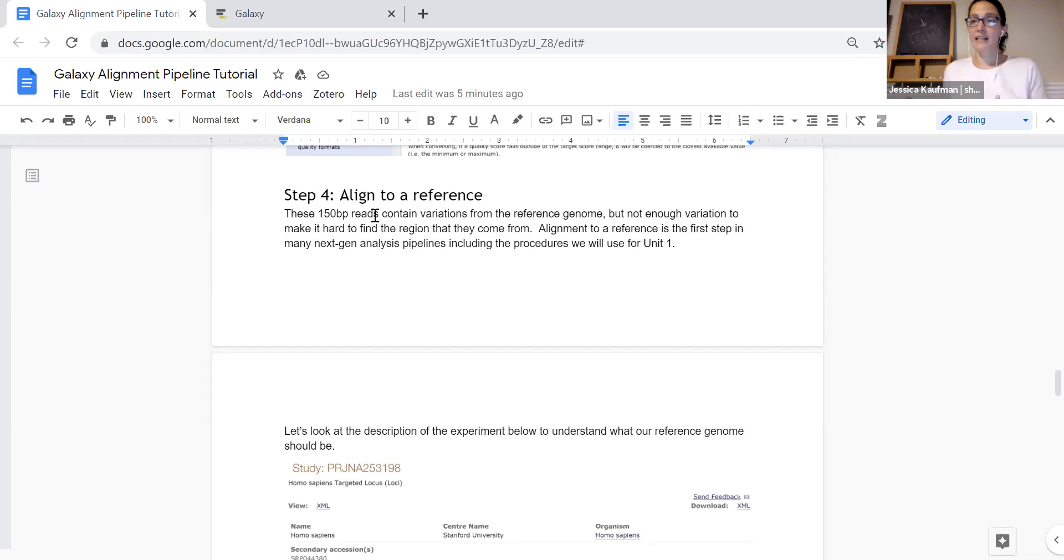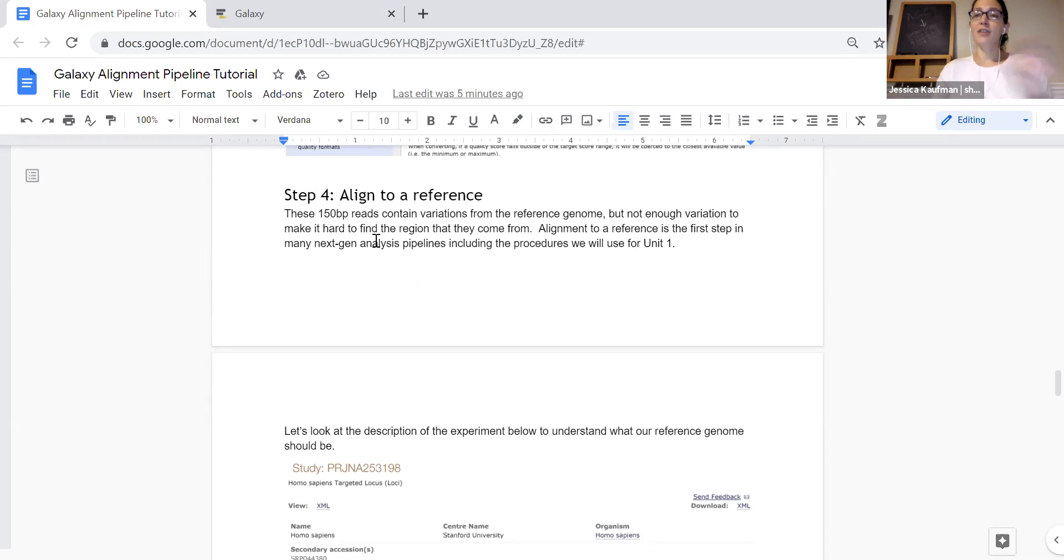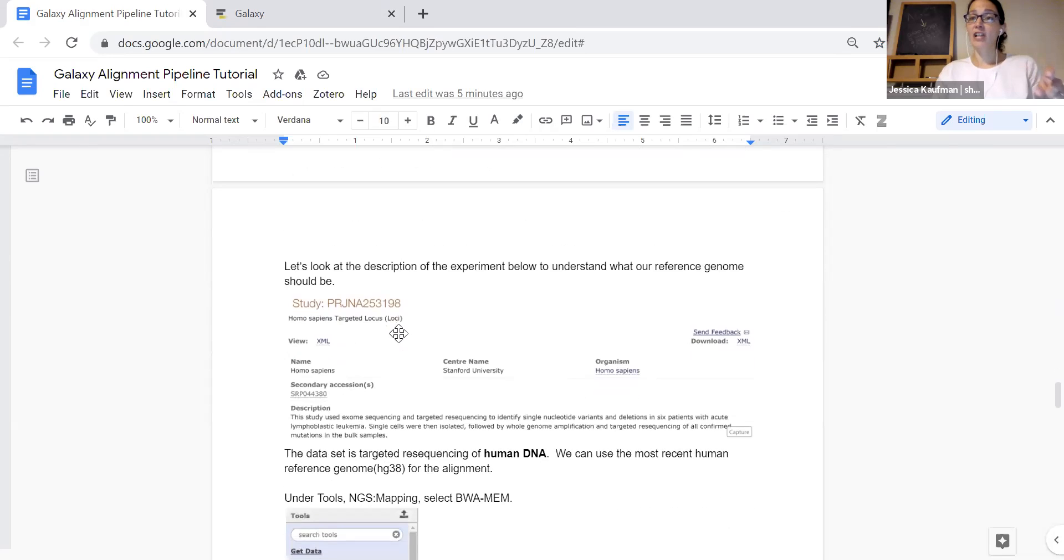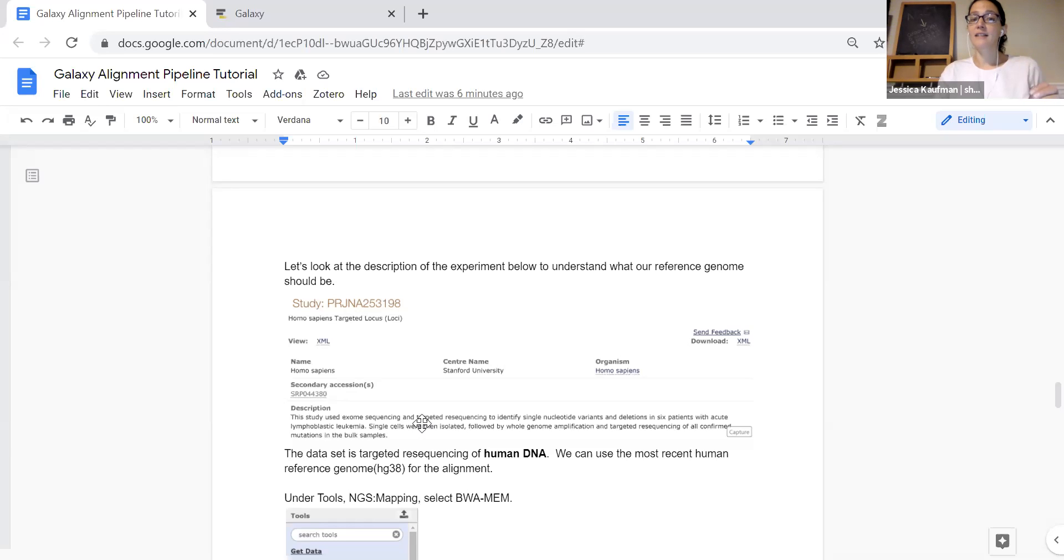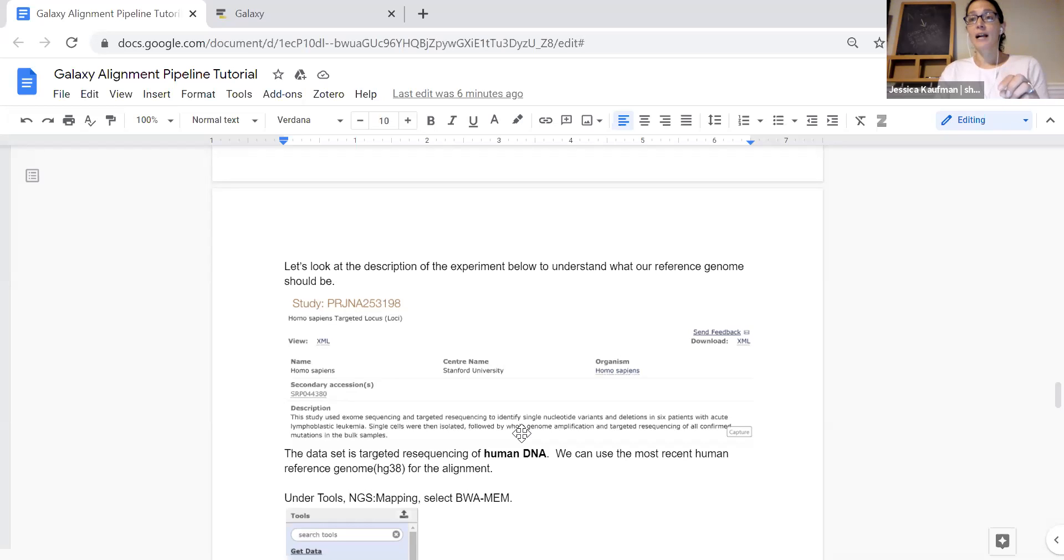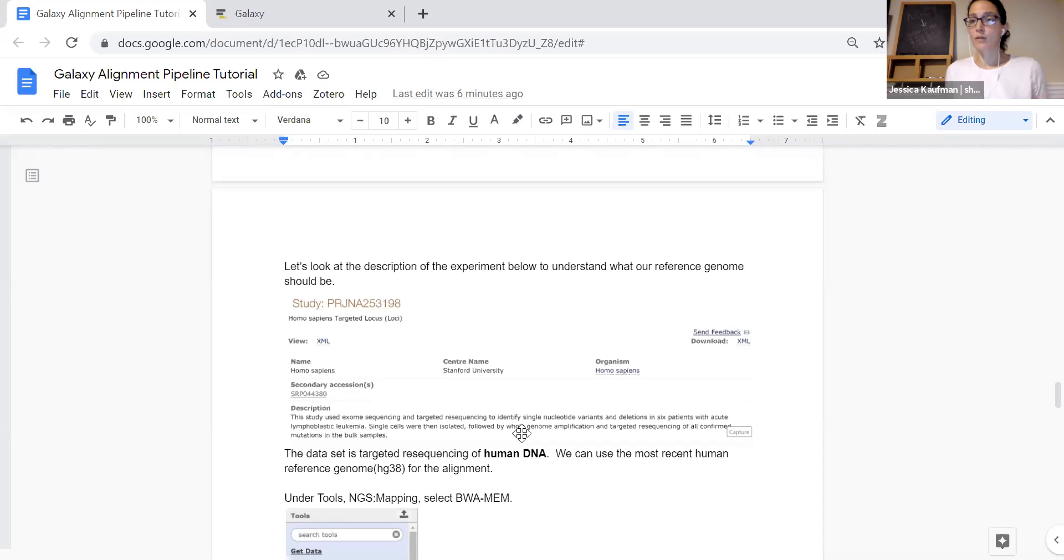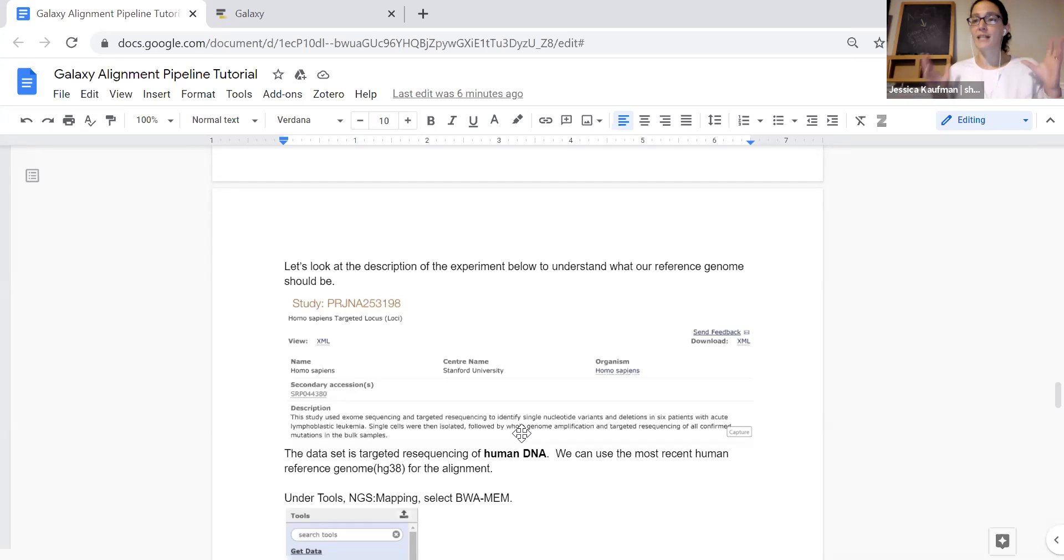We have data loaded into Galaxy and we want to think before we try to align it to a reference genome, where did this data come from? So I took a screenshot of the project on the European Nucleotide Archive where this data is from and we can see that this was a study of six individual human patients with acute lymphoblastic leukemia. These individuals had single cells isolated and whole genome sequencing done of those single cells. Because this is human DNA we're going to want to align it to the human genome and this is a genome that's already built into the UseGalaxy tool so we don't have to download from another website or sideload from another website. The reference genome we can get it directly from within UseGalaxy.